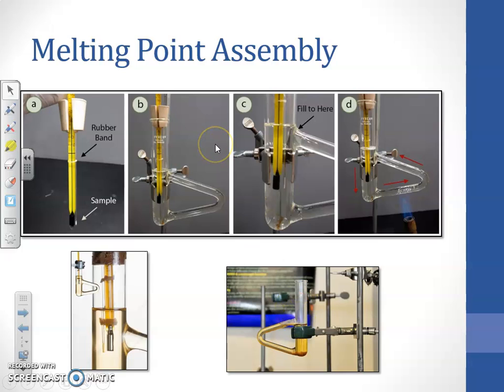You just drain the liquid paraffin we had filled into the Thiele tube and keep it as it is. We don't have to wash this Thiele tube at any cost, under any condition. Next time if you want to use it, take it as it is and fill it with liquid paraffin and use it as it is. That's why I'm saying these Thiele tubes should not be washed before or after the experiment. Normally you have a habit to wash glassware, but this glassware should never be washed.